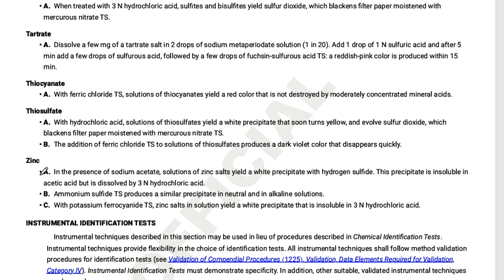So those are the cations and anions that the identification test is going to reference. If the compound that I'm working with has any of those, then there's probably going to be a 191 reference, and that 191 I'm going to flip to. They're in alphabetical order. I find what's present, what I need to test, and it will tell me those directions.